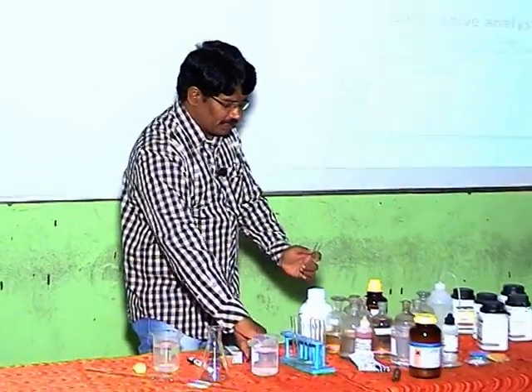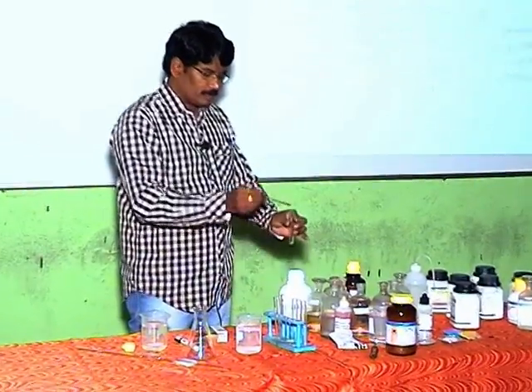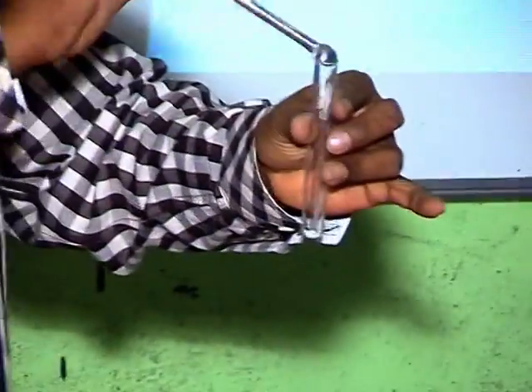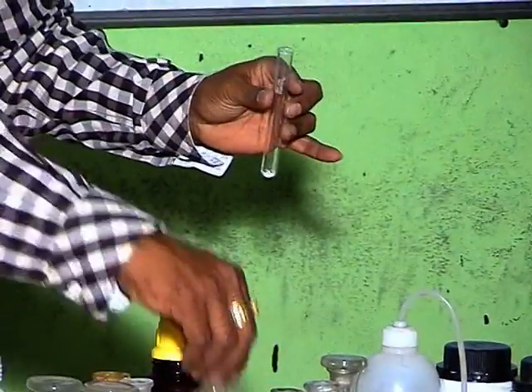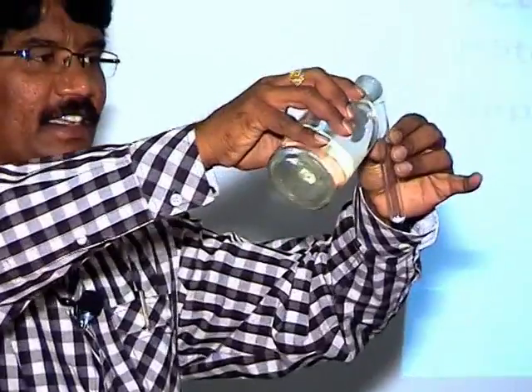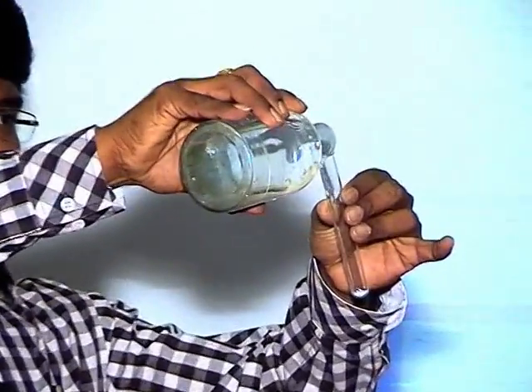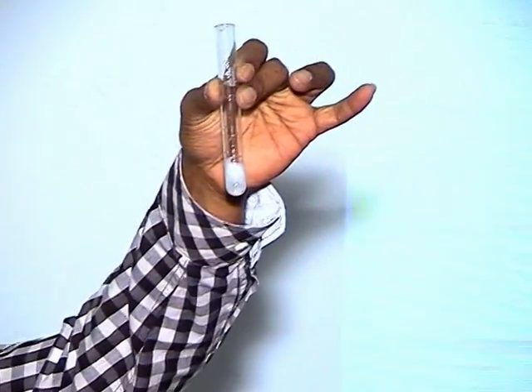For that, I am taking some carbonate salt into this test tube. Then I am adding dilute HCl like this. Now this is called a quick effervescence.